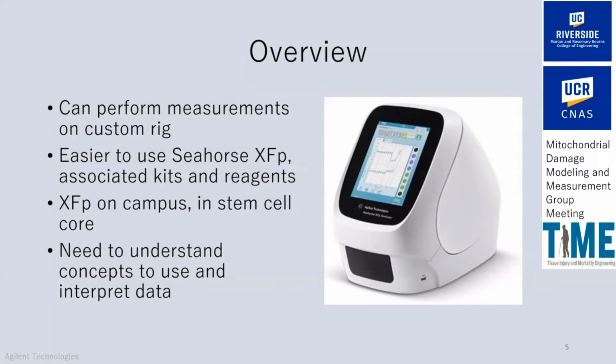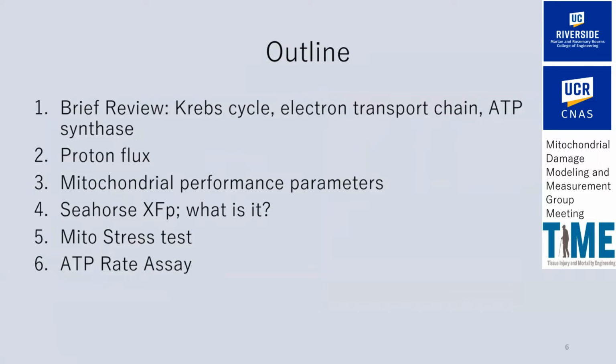There are other Seahorses that exist that you can use. I believe there's an XF24 at Loma Linda, which can be used for tissue samples. So you're not necessarily limited to just this instrument in particular. But if you do decide to use this, it's important to be able to understand the concepts associated with it so that you can interpret the data.